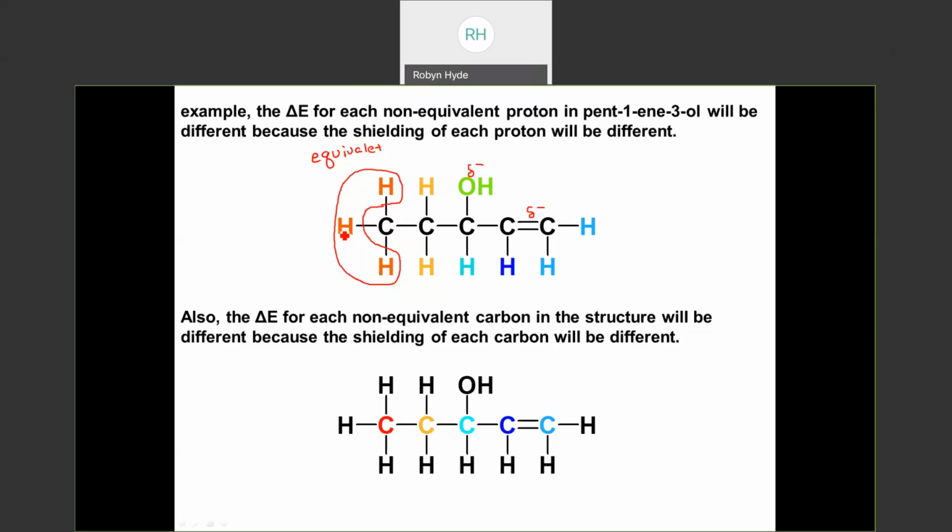Okay, let's continue working through our model. What comes next? So then next, I have these 2 protons. These 2 protons also bonded to the same carbon, are in the same environment. They are equivalent to one another. Are they more shielded, less shielded than my red protons? Less, because they are closer to an electron withdrawing group, so they are a little less shielded. Let's march a little bit further to the right.